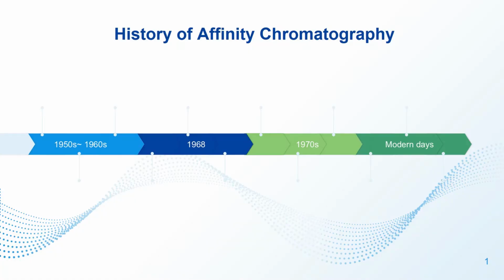Have you ever thought how to selectively separate your products after the production step of a bioprocess? Well, consider affinity chromatography as a great strategy.